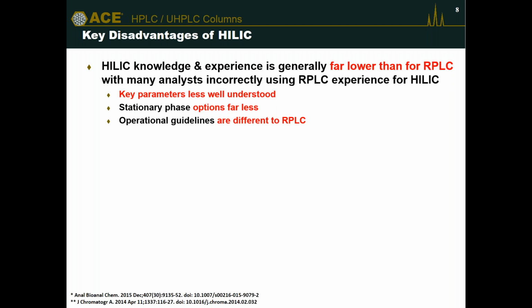In general, the parameters are less well understood in HILIC, and they're still being explored and explained even now. Typically, the stationary phase options are far less than reverse phase. And as I said at the beginning, the operational guidelines are different. And I'll touch on one or two of these later on in the presentation, especially around column equilibration.